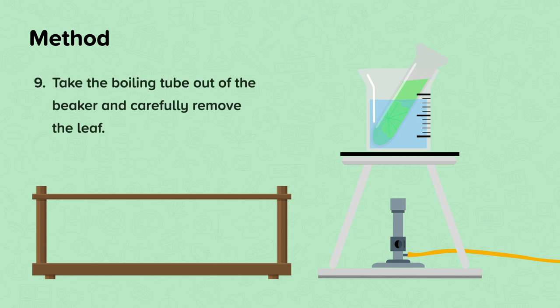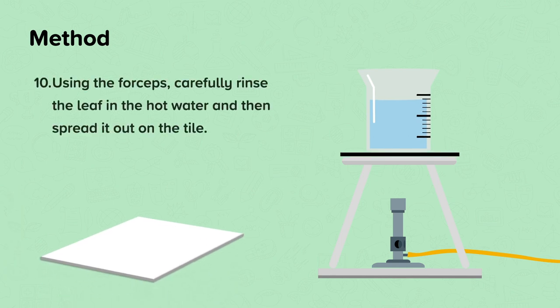Step nine, take the boiling tube out of the beaker and carefully remove the leaf. Using the forceps, carefully rinse the leaf in the hot water and then spread it out on the tile.